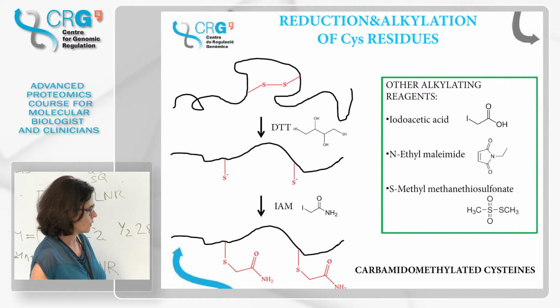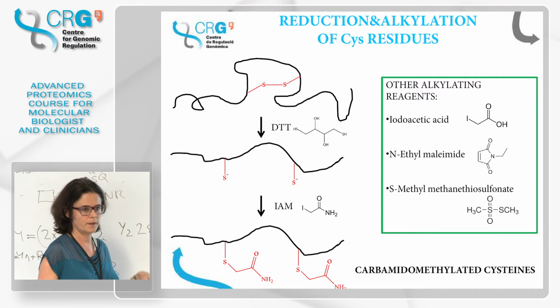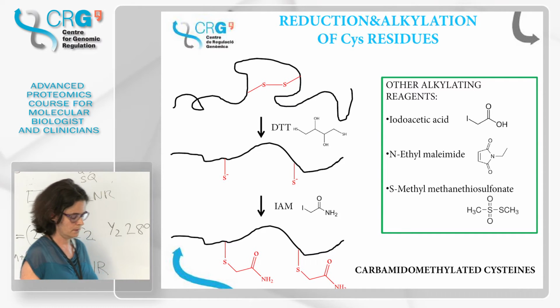But then to use the trypsin, you dilute it? Yes, you dilute the urea to lower than 1 molar, and you use it.